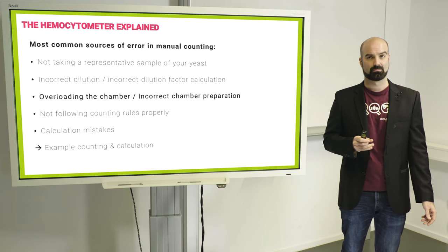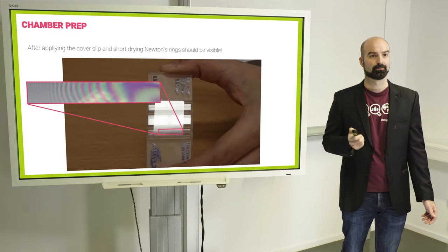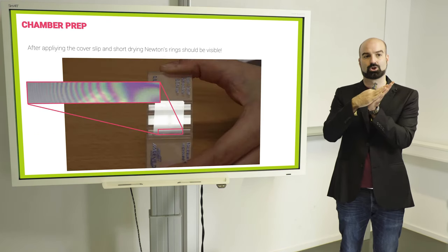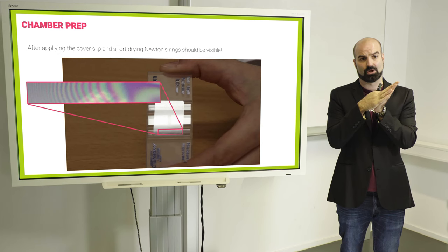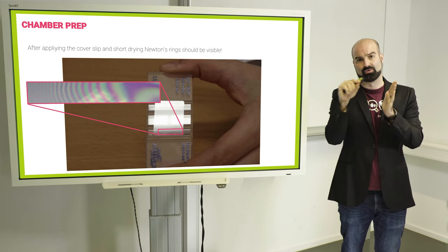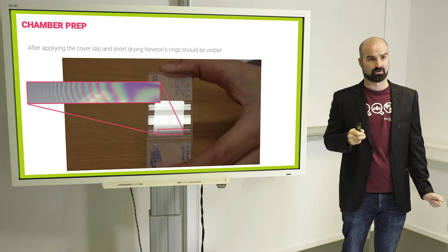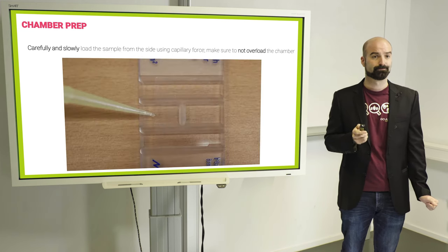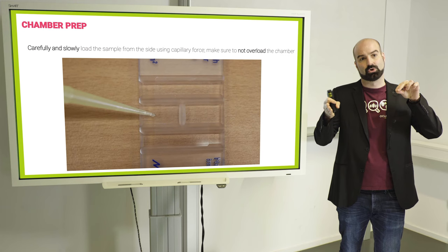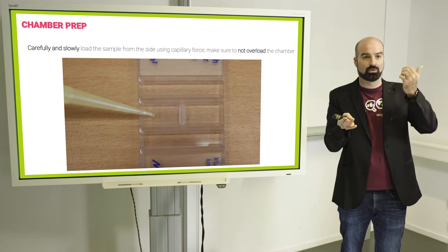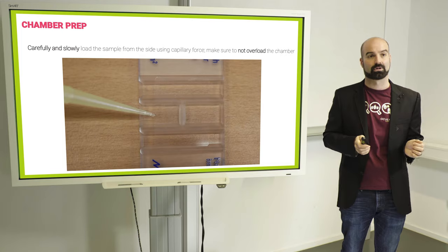Now, overloading the chamber. This is probably the second most common mistake that we see, that the Thoma chamber or Neubauer chamber is not prepared properly. When you're putting the cover slip on it, it should be held on by capillary force. And the way to check that this is properly done is you will see these Newton rings, which are basically interference patterns by the two glass parts sticking together. This is also explained in more detail in our other video, but just make sure you see these rings and load the sample from the side carefully with a pipette and let the capillary force suck your yeast solution under and into the chamber volume. And don't put the solution and then press the cover slip on top because you will not have a defined volume and you will not have an accurate count.